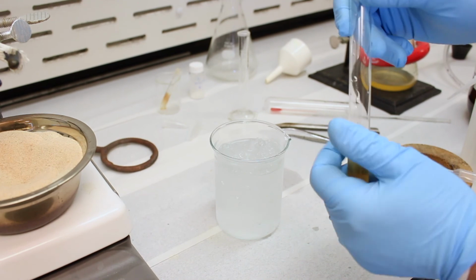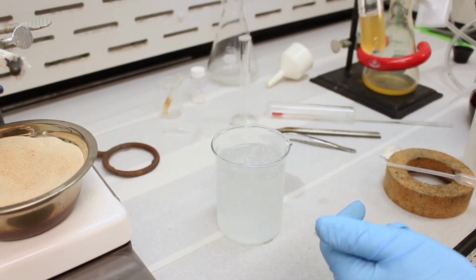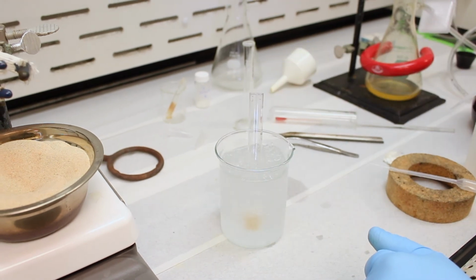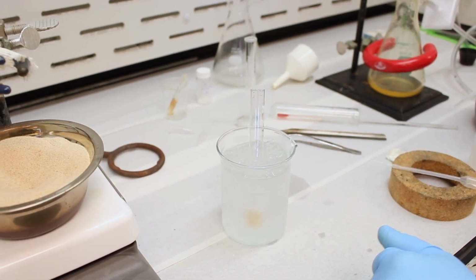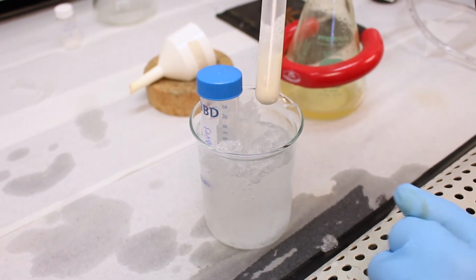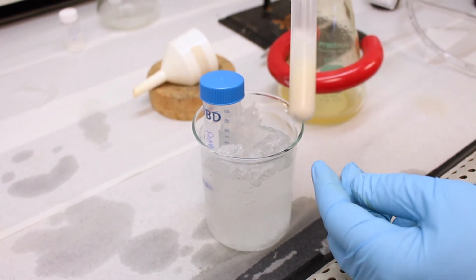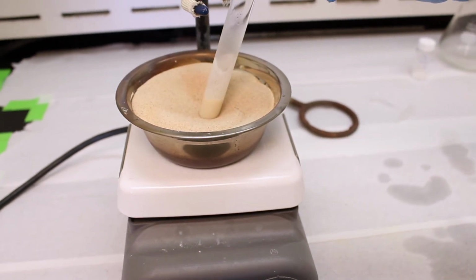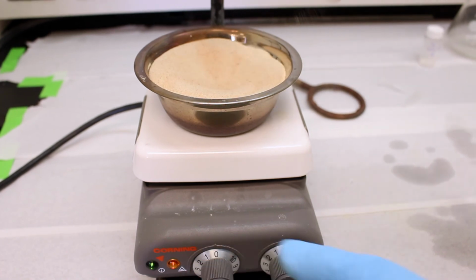So you can see it crashed some out. So those will help seed the reaction. So we'll place the test tube into the beaker and we'll let it cool for maybe 5 or 10 minutes. Okay, so we've got our crystals here in our test tube. They've been chilling for a few minutes. So what I'm going to do is agitate the solution real quick.